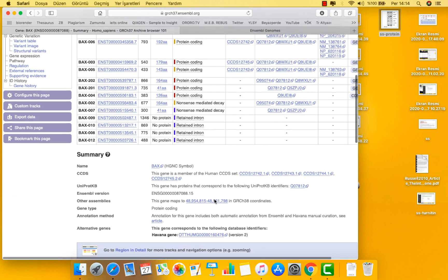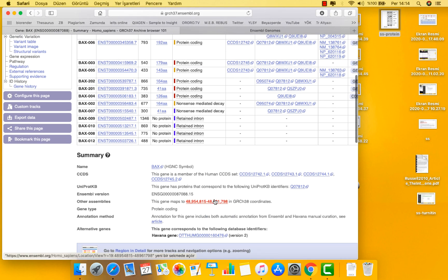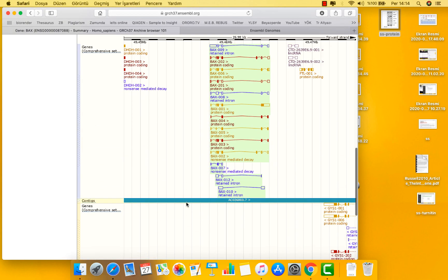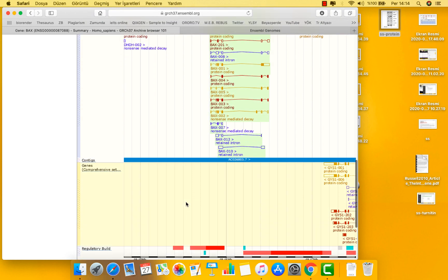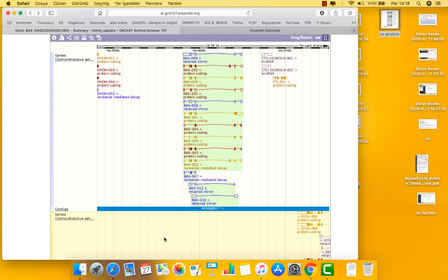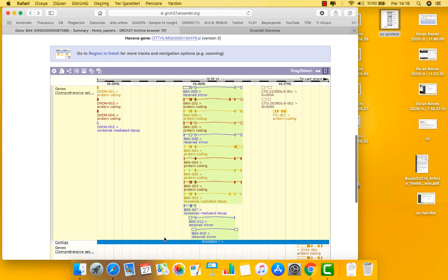Further down this page, we can see transcript models. The contig representing the genomic sequence is displayed as a thin blue bar. Transcripts above the contig are on the forward strand, and transcripts below are on the reverse strand. Boxes represent exons and lines connecting these boxes are the introns. Boxes are filled if they contain coding sequence. Unfilled boxes represent untranslated regions. Protein coding transcripts of the BRCA2 gene show coding sequence and are on the forward strand of the genome, above the blue bar.